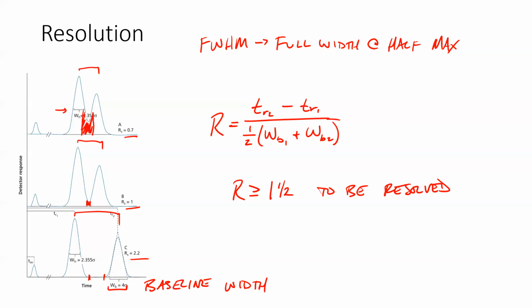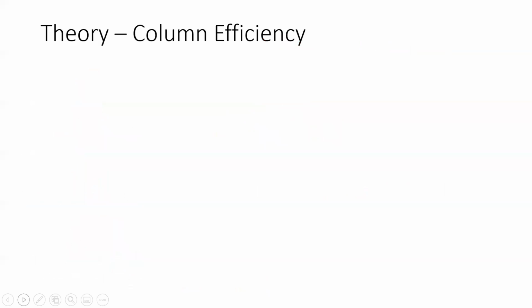We talked first thing on Wednesday about plates, and how when we talk about chromatography, we talk about these individual plates in a physical column that sort of only exist in theory in a chromatography column or even in a distillation head.